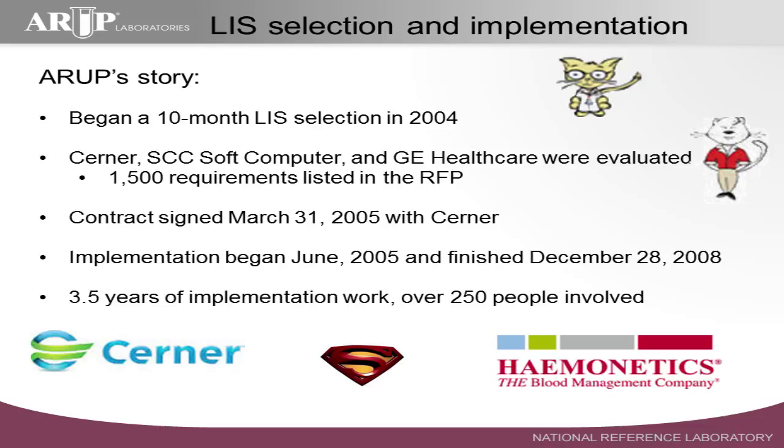So when you go out to make big purchases, you typically work with your procurement office or your purchasing office, and they want to use what's called a request for proposal approach. So you basically put everything in this document that you need in that product or service, and then push that out to the vendors that you've chosen, that you want to entertain a bid from, and you let them respond to it. So that's what we did. Took them about a month or so, I think, to get the responses. I think we gave them 1 month to get the responses back to our RFP.